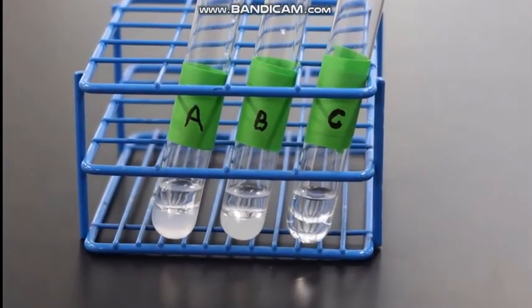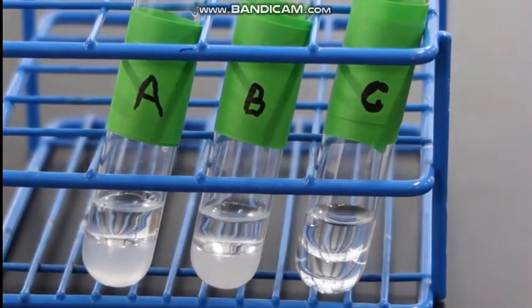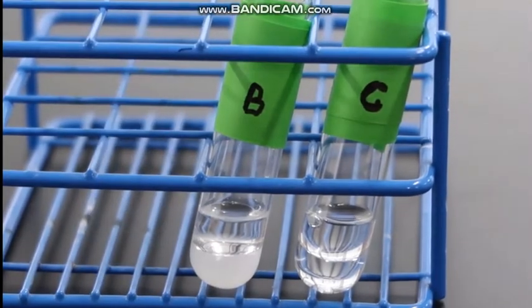Our initial observation is that there's a separation between these solutions, so it's important that we agitate them to see how well these two solutions interact.